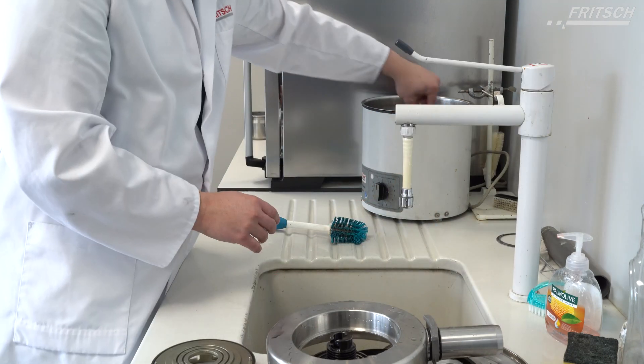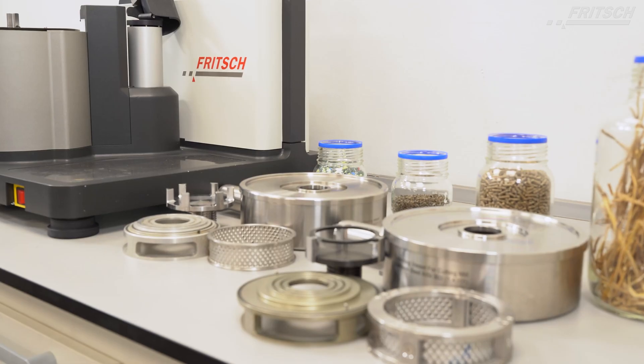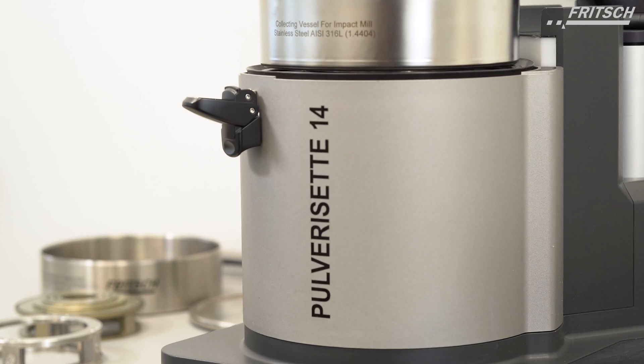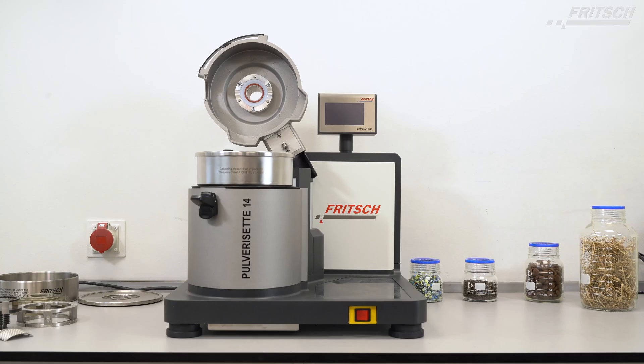Even in contrast to conventional cutting mills, the entire grinding chamber of the Pulverisette 14 premium line can be removed, making the cleaning of your mill as easy as possible. The Fritsch Variable Speed Rotor Mill Pulverisette 14 premium line — one of its kind in the industry.